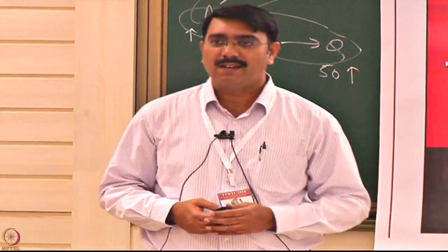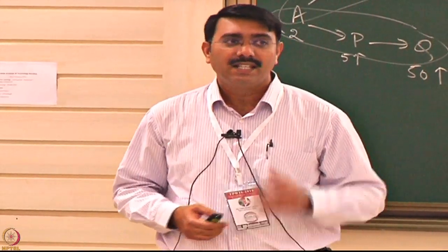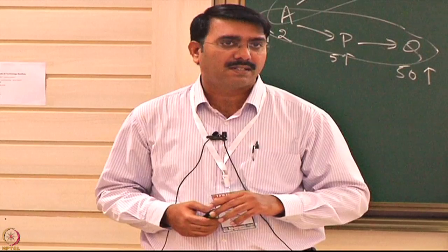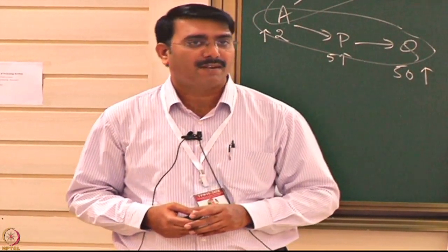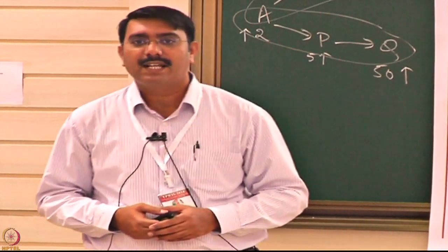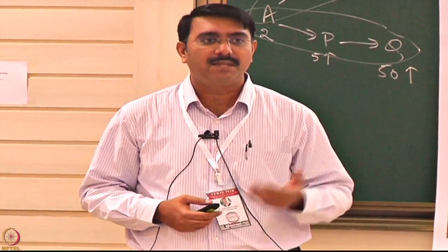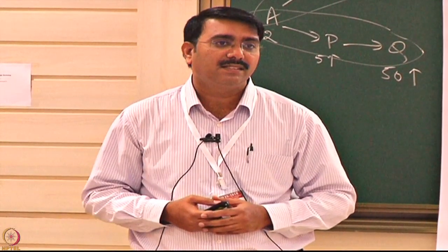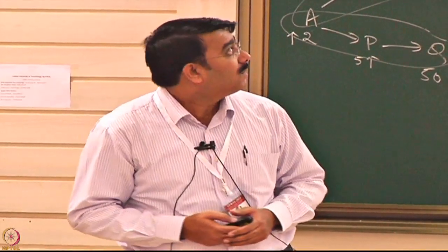This is the alternate technology, the biolayer interferometry, the interference based technology. SPR is the surface plasmon resonance, but this is very different technology-wise, as well as a high throughput platform. So how this technology will be helpful in your interactomics kind of workflows, I will go through the technology behind it, the principle behind this, and how you can use this technology in your applications.